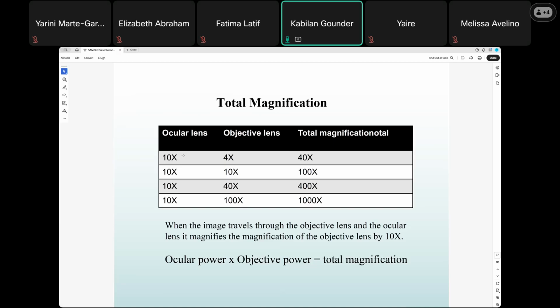So you have to use the microscope with different lenses that multiply the image size. We need to know how many times you magnify the structure of your given sample, whether it is 10x, 20x, 40x, 50x, 100x. How do we know?